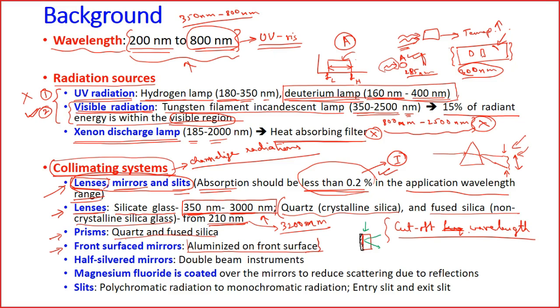Okay, so how do you account for that loss? It will become very difficult if you are not able to account for this energy loss within the spectrophotometer reading, because it will then get added up with your sample incident radiation, because what you are doing is looking into the incident radiations from the radiation sources.